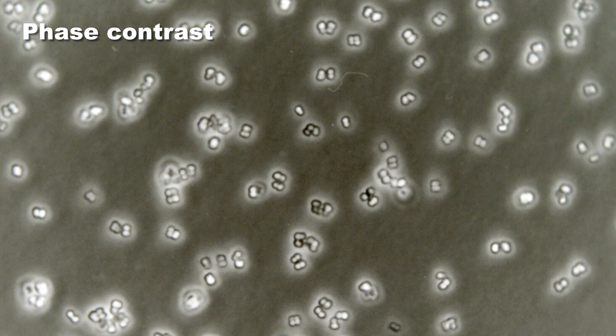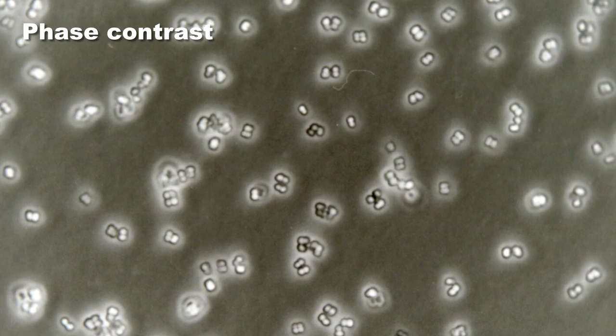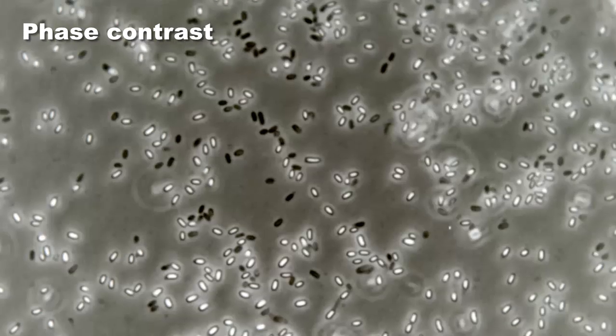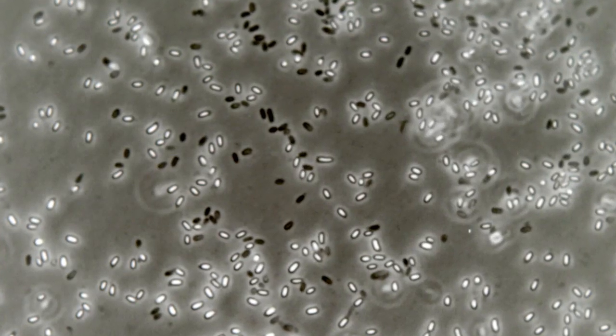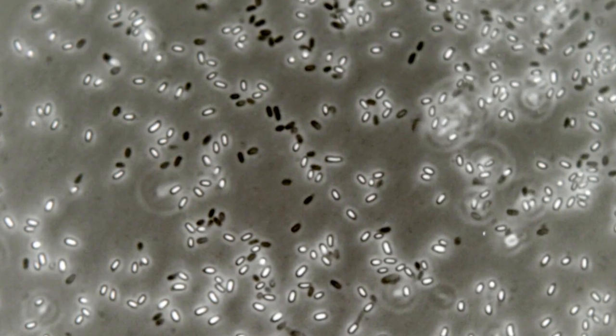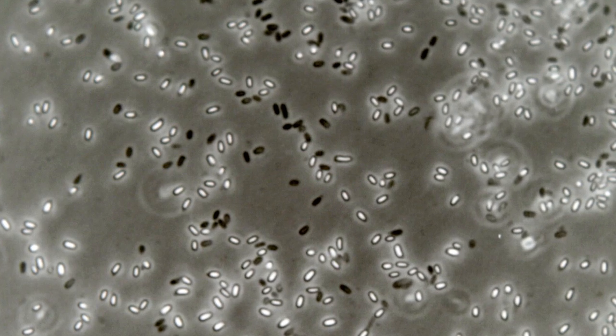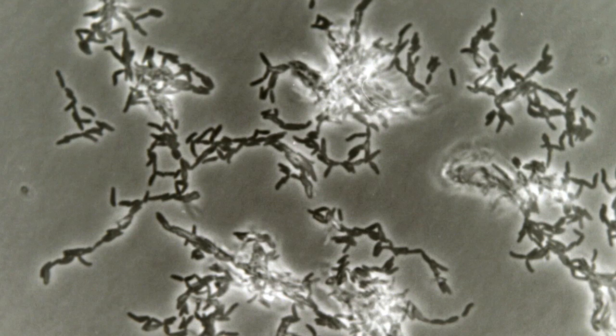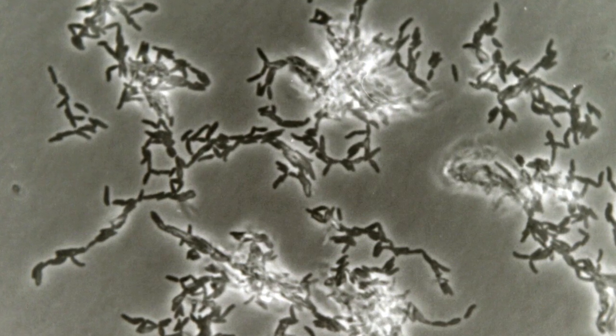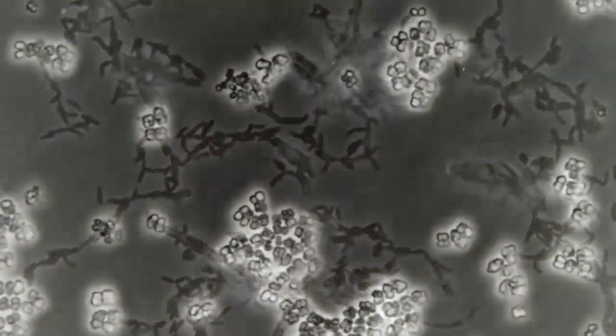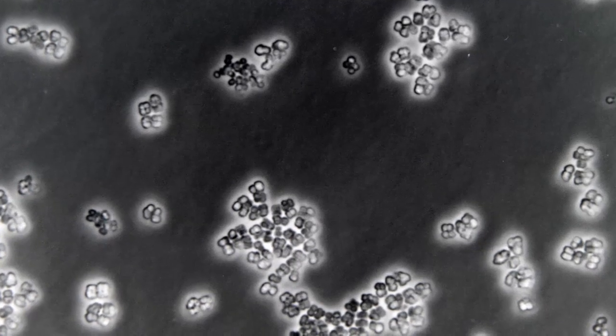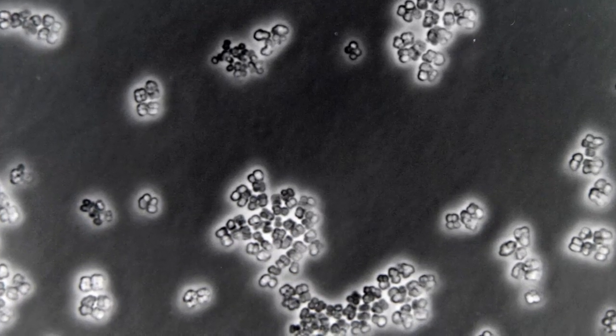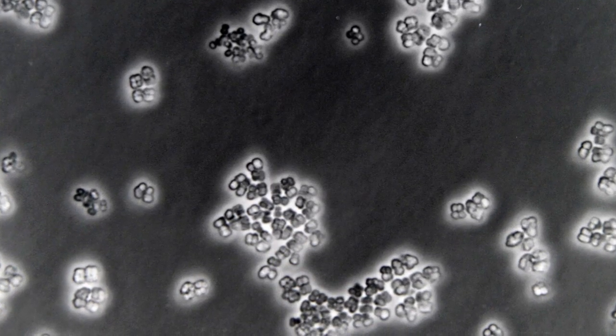And so there are a couple of pictures that I'm going to show you right now. And you can actually see that the bacteria are quite well visible. And they use the magnification of 1000x and phase contrast optics. And so they can be seen without problems. So these are unstained bacteria that you see right now. So they are alive. And they can be seen moving around in the liquid medium. And it's possible to observe them quite well.